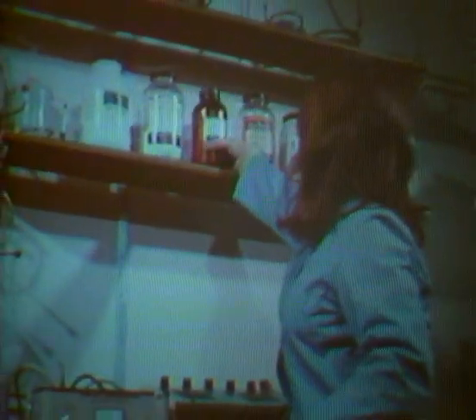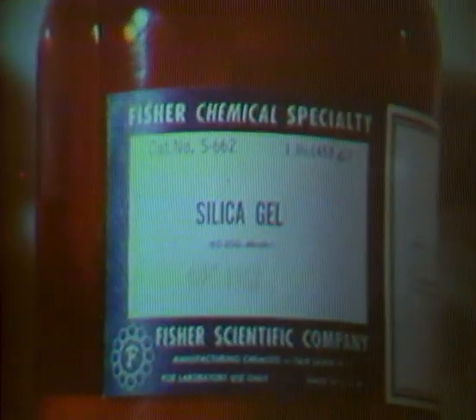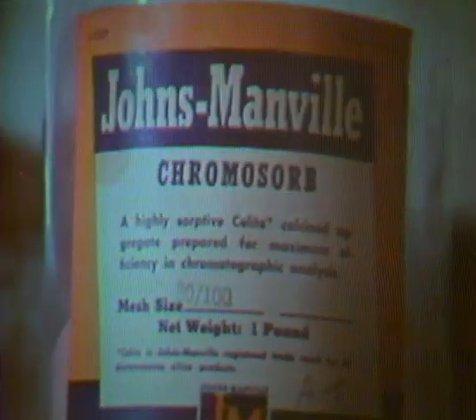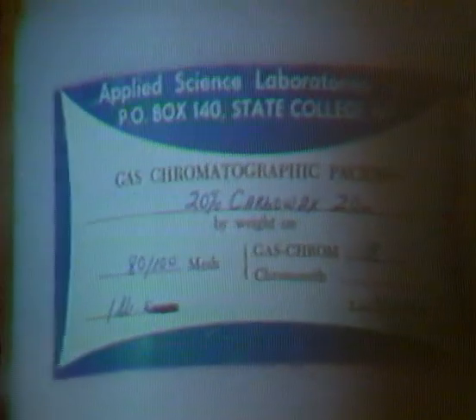In gas-solid chromatography, the packing may be an adsorbent, such as silica gel. In gas-liquid partition chromatography, the packing usually consists of diatomaceous earth or other support particles coated with the stationary phase. For example, 20% Carbowax.